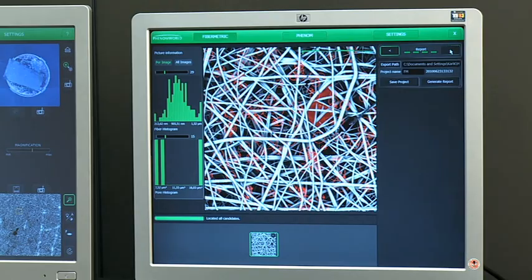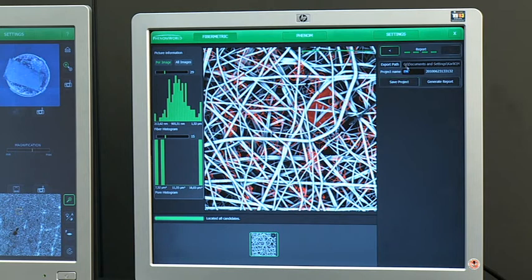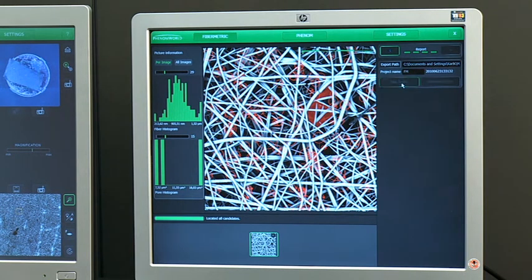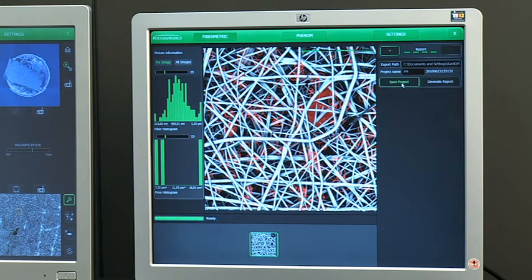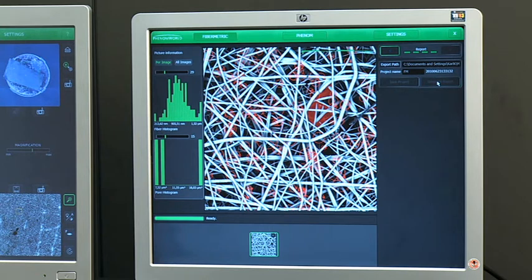The fourth step in the FiberMetric wizard is used to store all generated data. Selecting Save Project creates a dot fiber file which can be opened for later processing. Generate Report stores all images and creates an XML file containing all the measurement data.